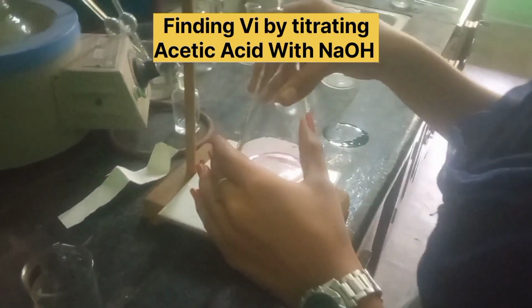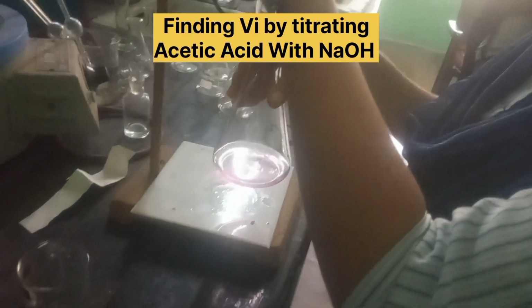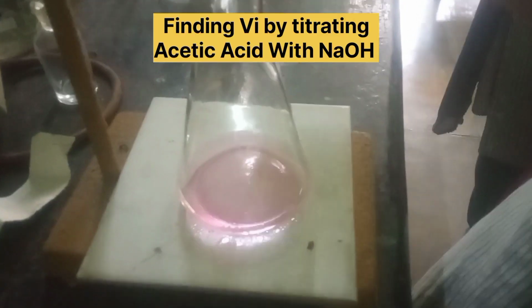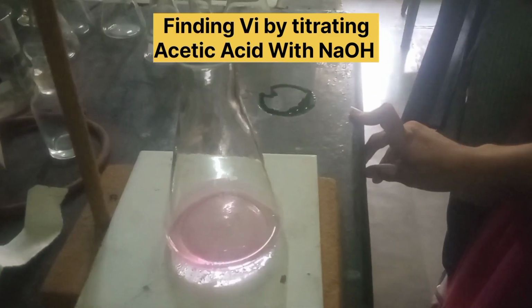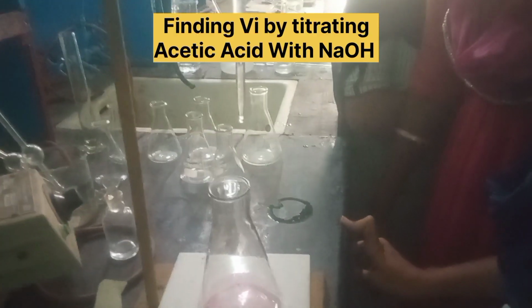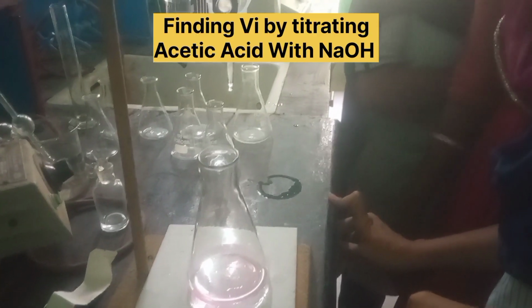One student is doing that. She got the endpoint here as pink color. So this is to be considered as the initial volume of NaOH required for neutralization of acetic acid taken. So this is Vi.